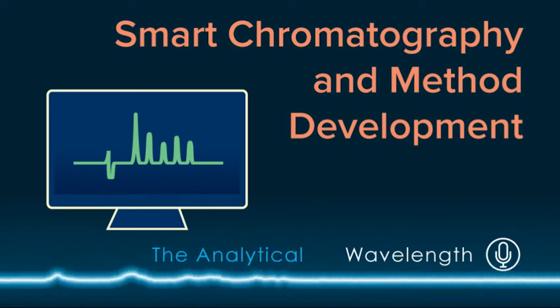Yeah. And I think you were mentioning earlier this idea of treating analytical methods as a black box that you just plug and play into. I imagine that's also something that comes up in using this method development software, of using this as a way to not just spit out a method, but to understand why it's coming out to the results that it gives you in using a particular chromatographic method.